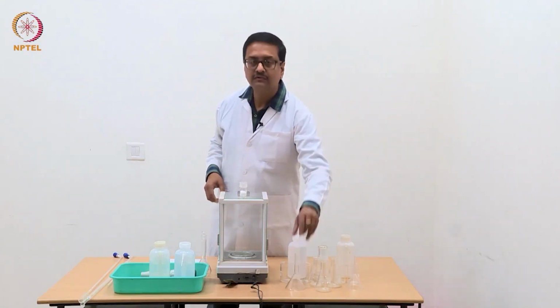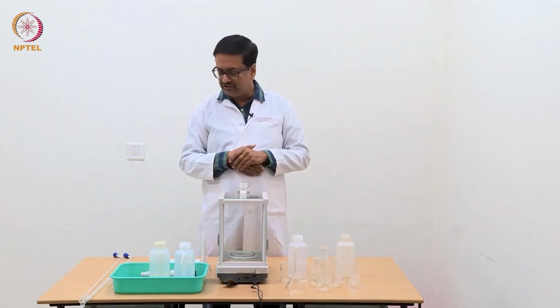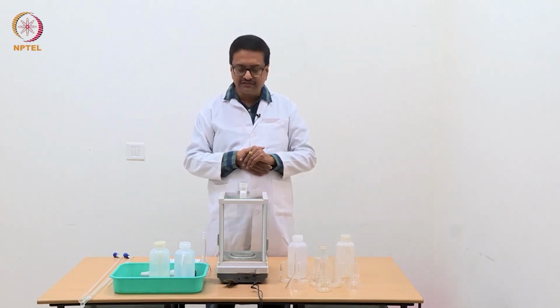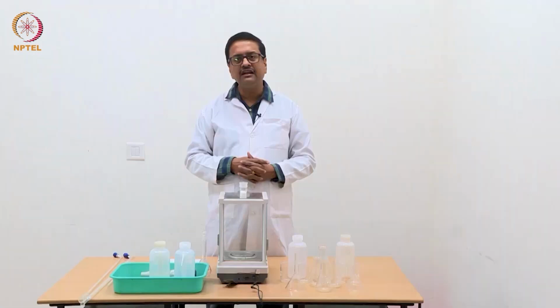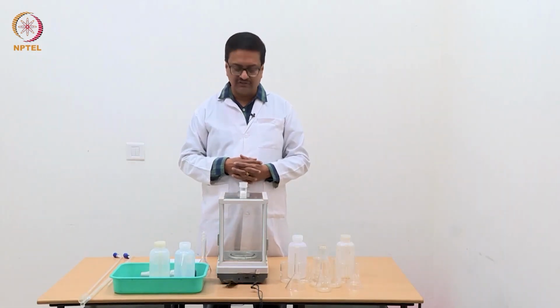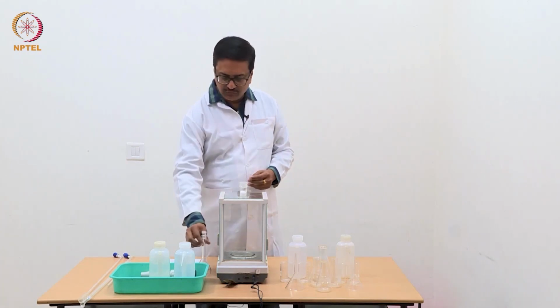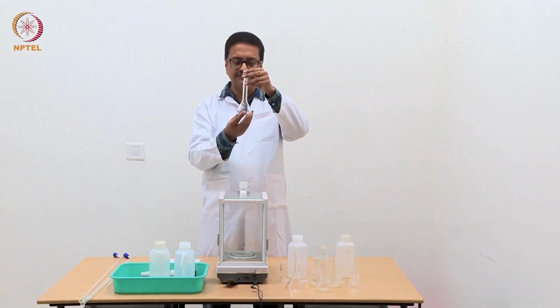So now let me refresh you with what we have discussed in the class. To prepare 100 ml of primary standard oxalic acid solution of approximately 0.1 normal strength, you will need 0.63 gram of oxalic acid to be transferred into this volumetric flask.